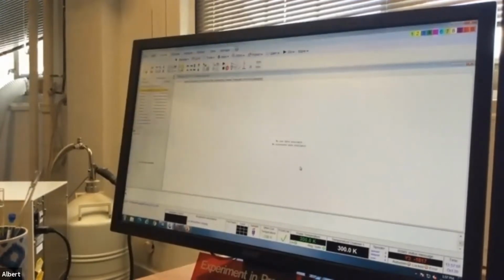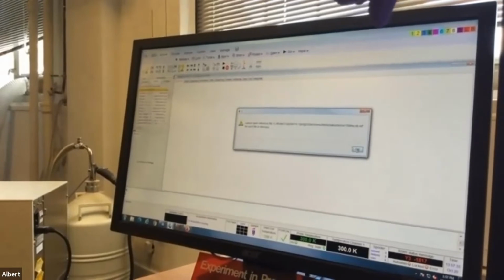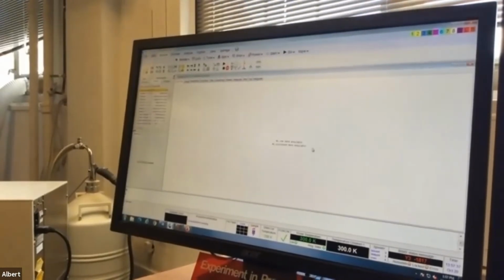All right. So now it's going to lock, and it'll look down here in the bottom left corner. It'll tell you all the progress. When it's done, it'll say either finished, succeeded, or done. So right now it's still finding that material. Hold on. Same mistake we made yesterday. You have to put the sample in. So type IJ for inject, and then enter. Click OK, because it's not going to lock if it's not in there.